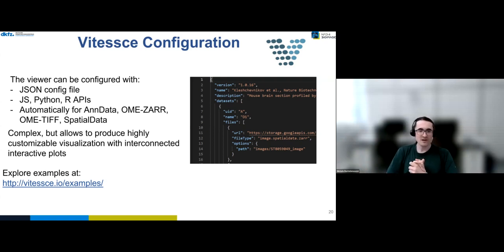This can seem quite complex, but at the end I'll show you how we can use the Python APIs and a couple of additional packages to really simplify the creation of these visualizations, without having to learn and work a lot with this complex configuration syntax.